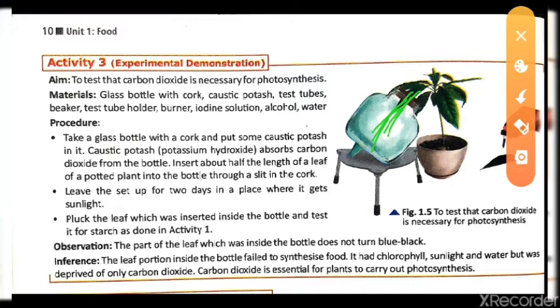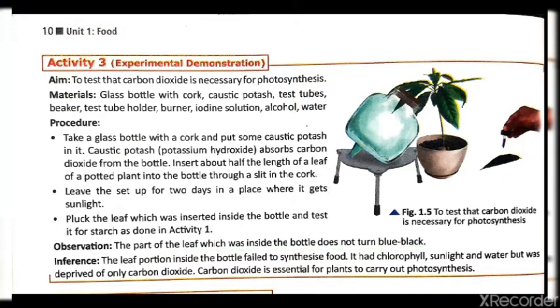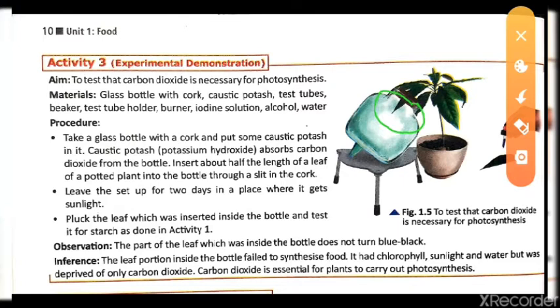Now after that you will see that the part of the leaf which was inside the bottle does not turn blue black. That means the leaf that is inside the glass is not getting the carbon dioxide. So when it is not getting the carbon dioxide, it will not turn into blue black solution after giving the iodine. So this one becomes blue black. So by performing this experiment, we have got that carbon dioxide is necessary for the photosynthesis.